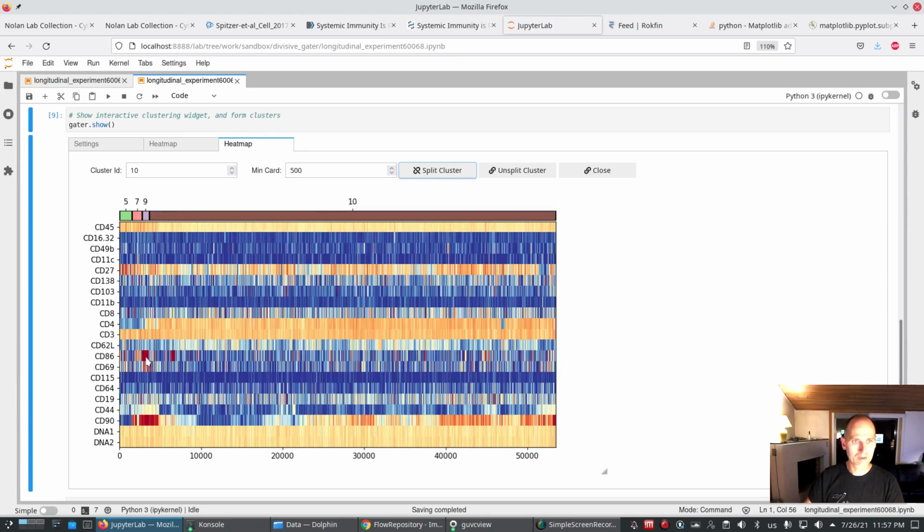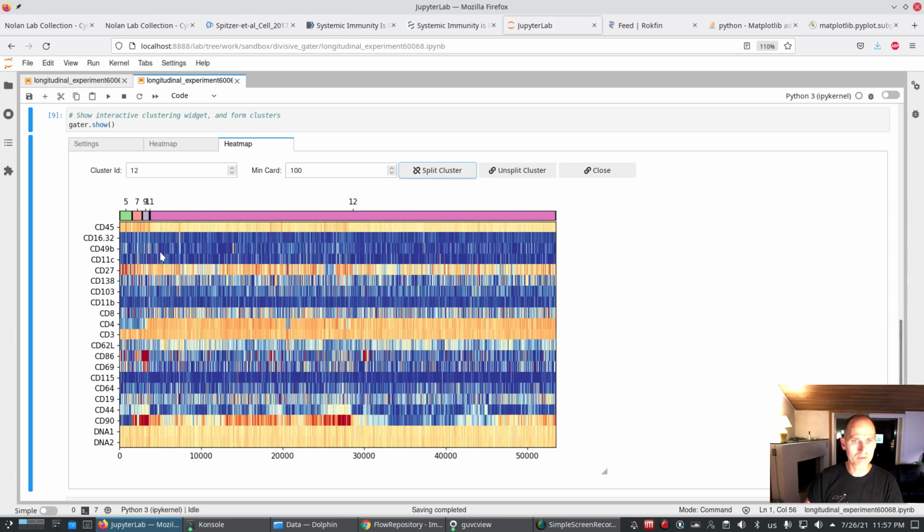Here they are. So now I didn't get all the CD86, so maybe I want to go on a little more, but I really don't know if it's worth it. So let's just try to have a smaller number. Yeah, no, this was too small. So I don't want to do that, so now I can say, go back. This was too small. So 500 is probably better.